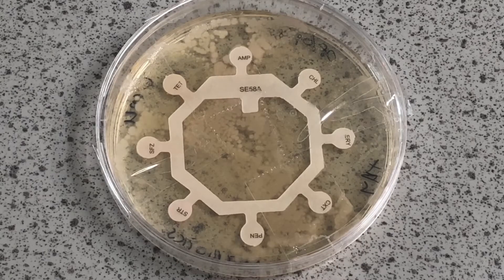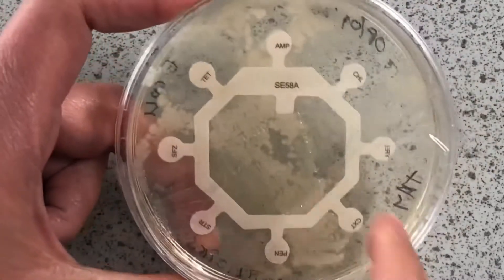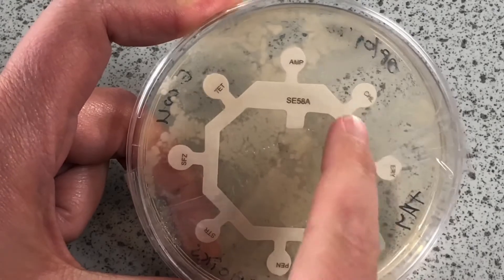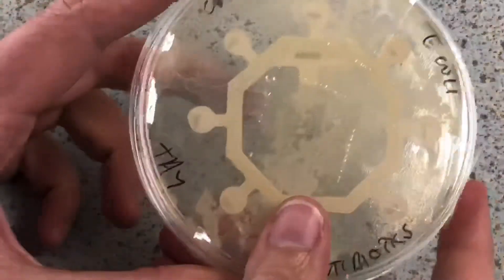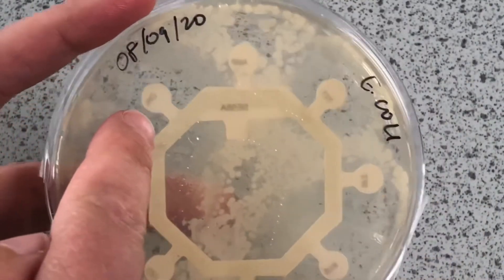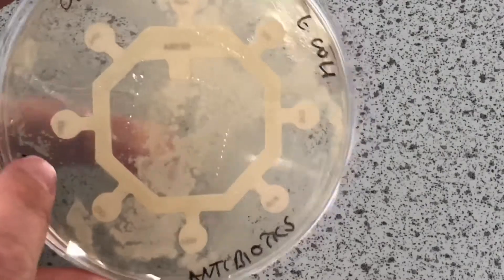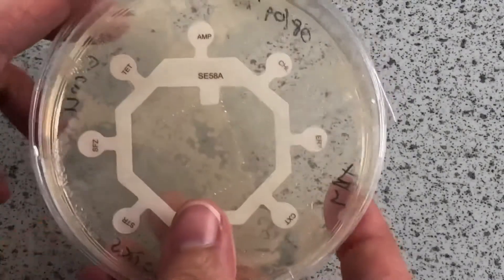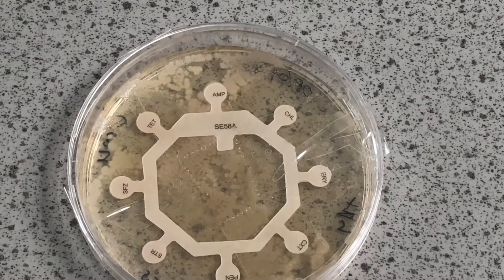Here are the results from the E.coli experiment, six days after putting the E.coli bacteria onto the agar plate and adding the disc of different antibiotics. Quite a lot of them haven't had much impact. We've got a nice zone of inhibition on this one — this is probably the antibiotic to kill E.coli. You can see that big zone of inhibition where you can see the table through it because the bacteria hasn't grown. A lot of them have had no impact, with bacterial growth around the disc. The one with the clearest zone is what we're going to work with today.